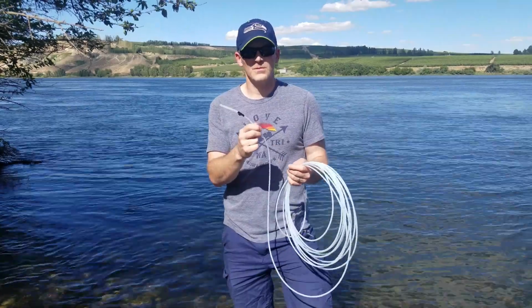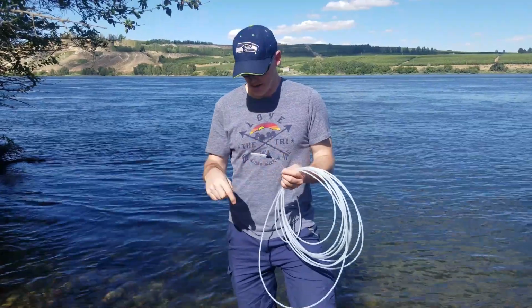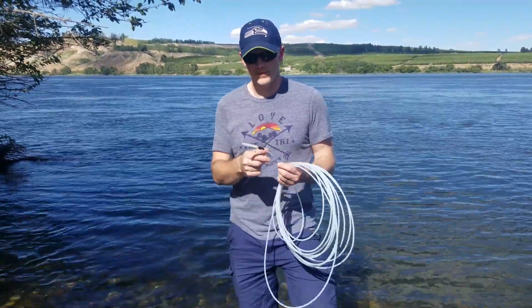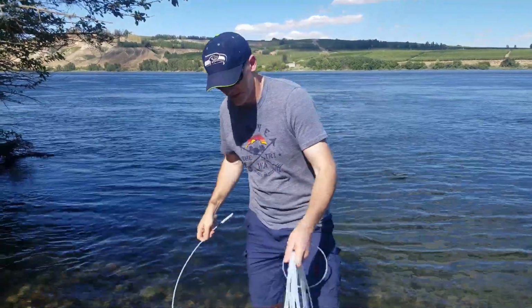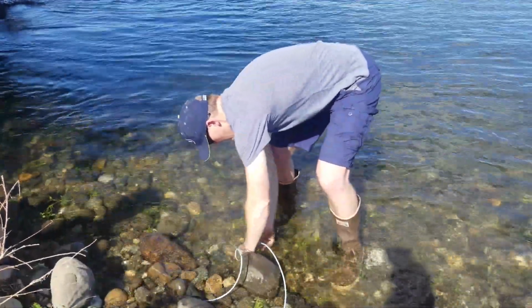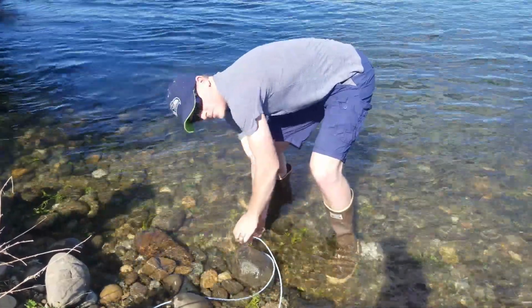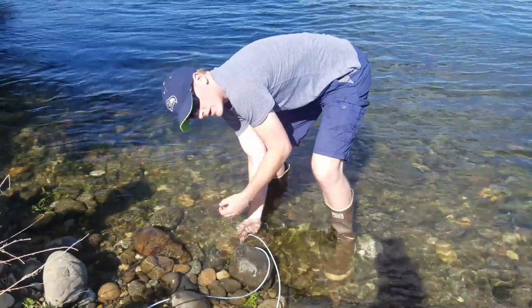This is the tubing that's going to be used to sample surface water. You take this tubing and zip tie it onto the top part of the middle push point that's been installed, right where the handle makes a cross or an elbow. The key aspect here is you don't want the sock to be right in the sediment. You want to get it off the ground a little bit so it's sampling water instead of just sediment.